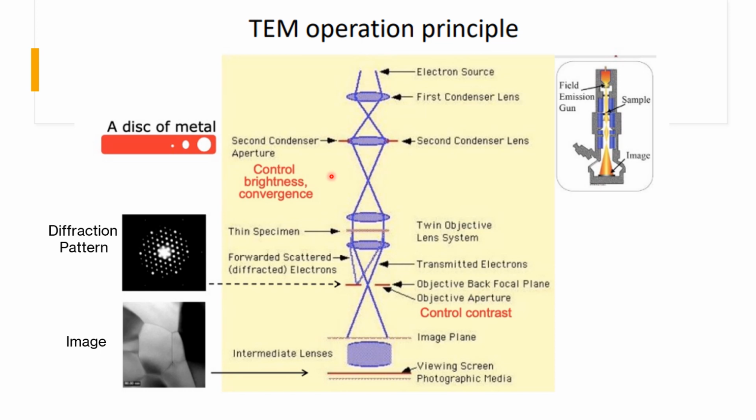So in electron microscopy, how is the lens made? This is not the conventional optical lens. It is actually an electromagnetic lens. Whether it is the condenser lens, the objective lens, the intermediate lens or the projector lens, they all are electromagnetic lenses. An electromagnetic lens works on the principle that it consists of a solenoid.